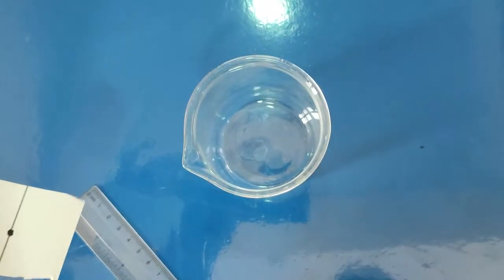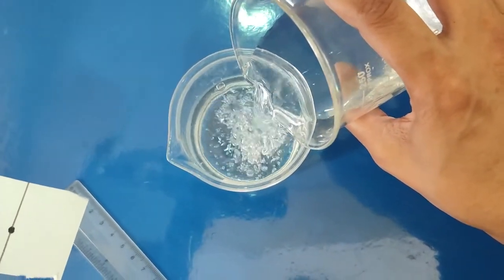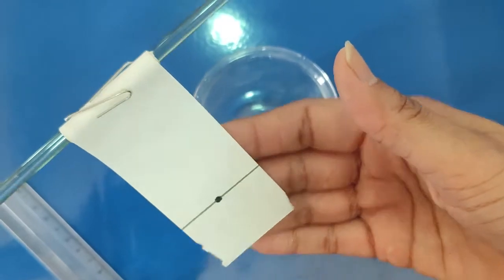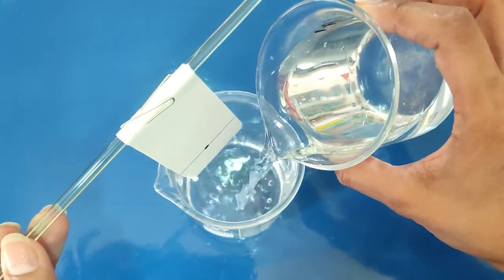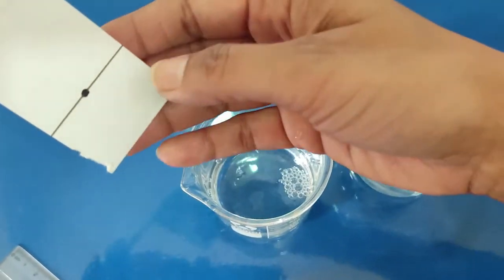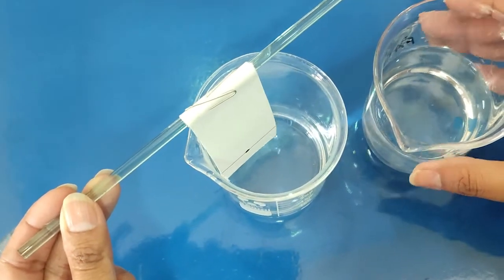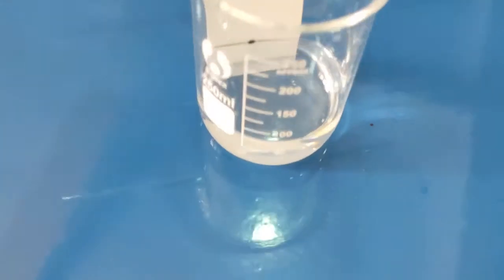I will use this and pour some liquid in it. So this is the paper which we have adjusted on the tube. Now we are going to place it here, but before that, we are going to use solvent. Solvent level should be below this baseline. Now we are going to dip this. The solvent will start to move up.